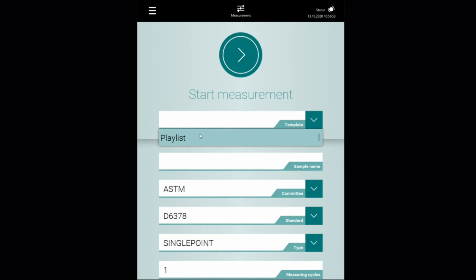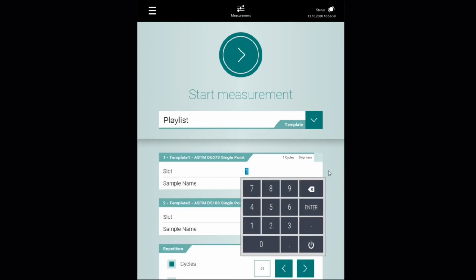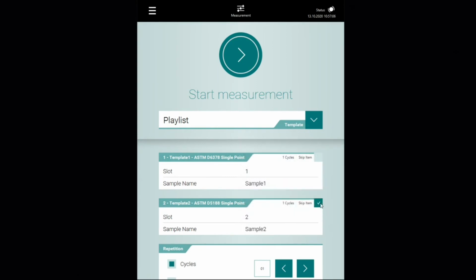Back on the measurement screen, find your playlist within the templates. You can review and modify all settings also without the cockpit. However, the cockpit makes configuration so much easier.